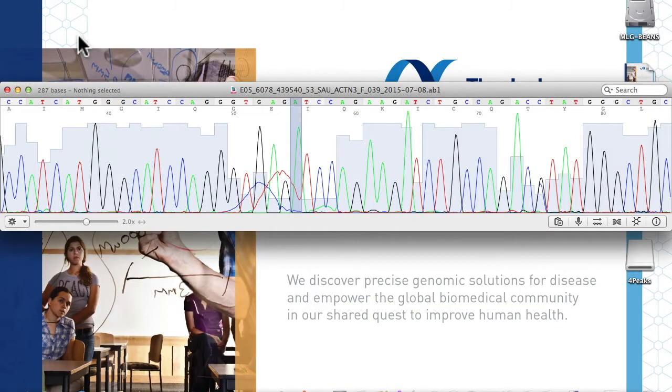Once the sequence has been trimmed and manually corrected, the sequence needs to be blasted to determine if the sequence is representative of the gene you intended to analyze. In this case, we intend to analyze human actinin 3. This can be done in one of two ways.